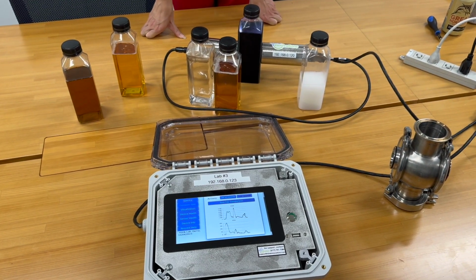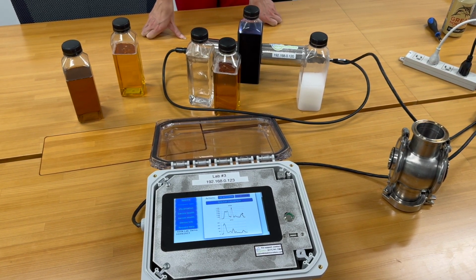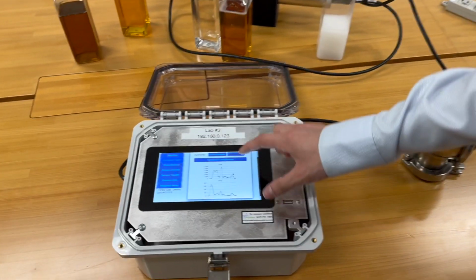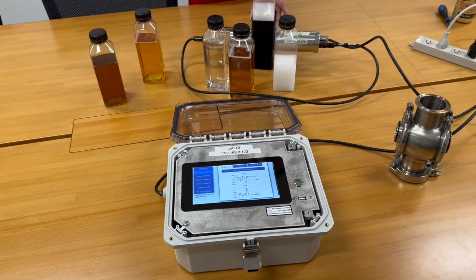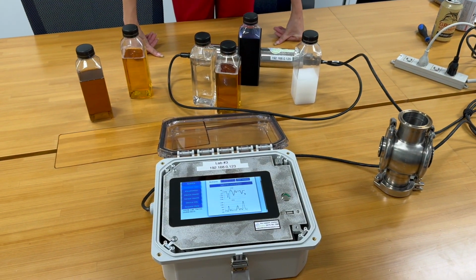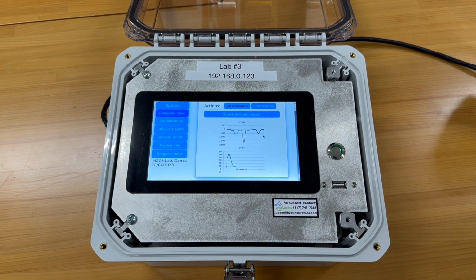This is what this first variant, this first fragrance, this first variant of body wash looks like. I set that as a baseline. Now I'm putting the second variant. So that's the difference between the two products with different fragrances.